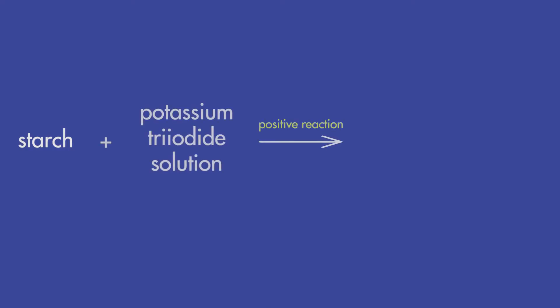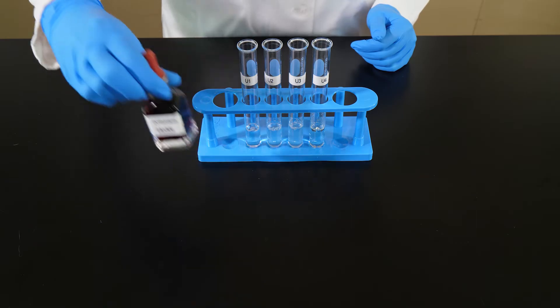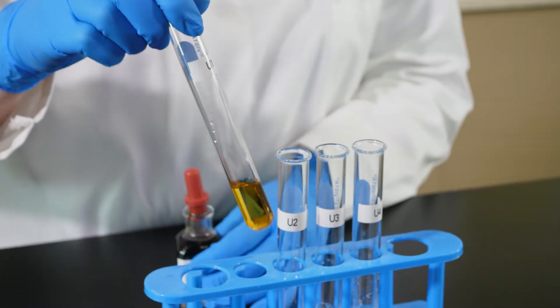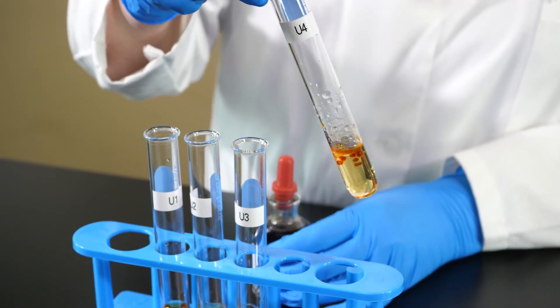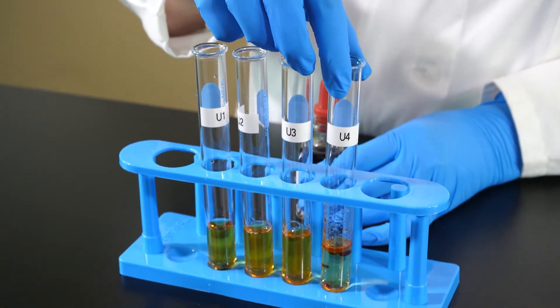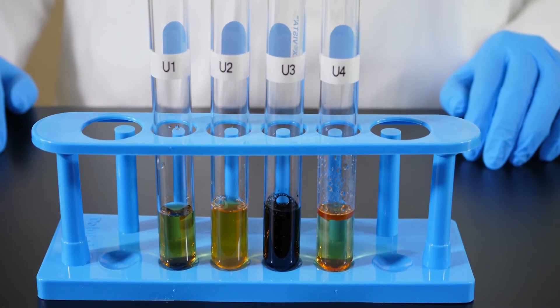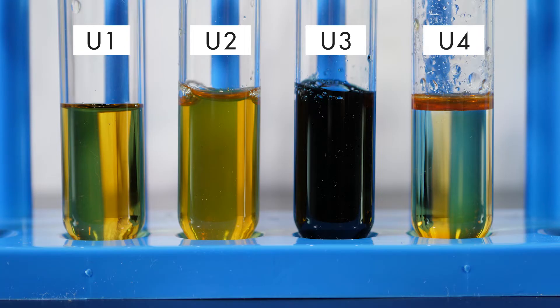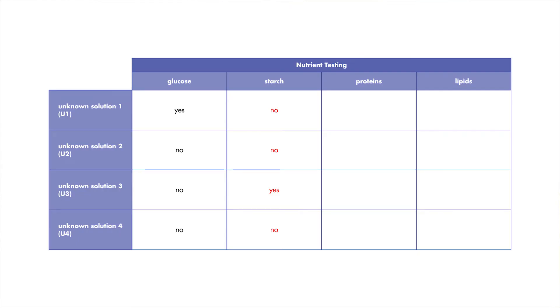If starch is present in a solution, a positive reaction between potassium triiodide solution and starch will occur, and the solution we are testing will turn black. We add 4 drops of potassium triiodide solution to a sample of each of the unknown solutions, then swirl each test tube to mix the contents. The reaction should take about 30 seconds. The solution in the test tube containing unknown solution 3 turned black; therefore, we know that starch is present. Since none of the other unknown solutions turned black, we know that starch is not present in those solutions. Record your observations in your lab journal.